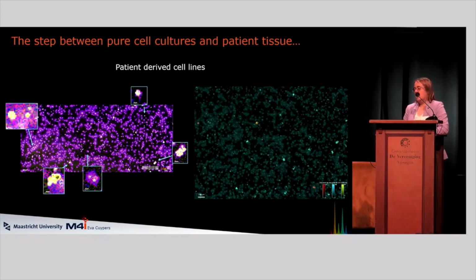They cannot find any difference in the genomics data, not in the transcriptomics data, but there is something happening, because the recurrent patient-derived cell lines do not react anymore to the therapy. So we are currently investigating what is happening there. Are cell types changing? Is there something changing in metabolites or lipids?